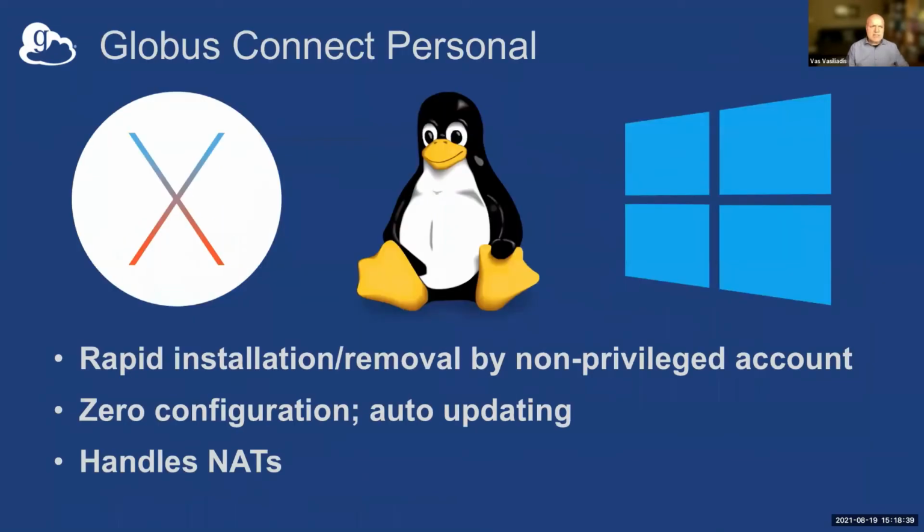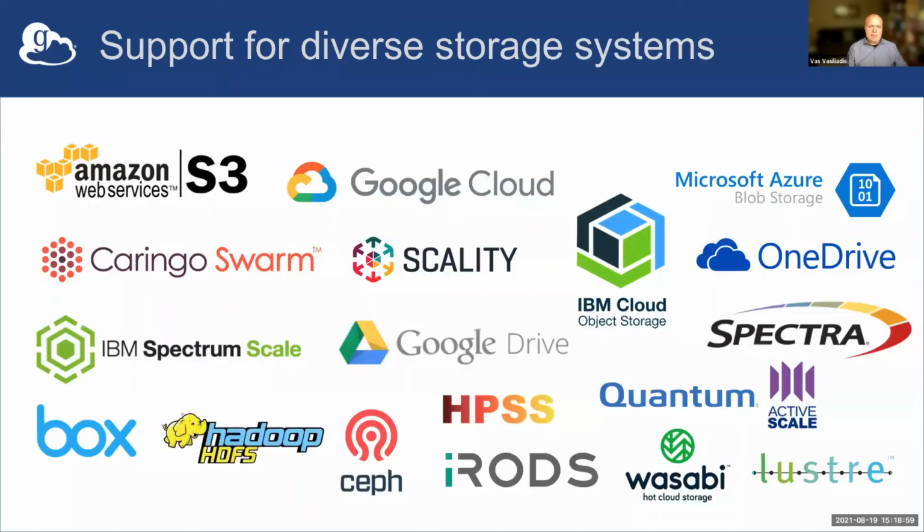For some systems, you would have to use Globus Connect Personal. For instance, a lot of the capture devices on the instruments are Windows-based. So we don't support Windows Server, so you would install Globus Connect Personal, and there are ways to structure that so that it can operate in the mode I was describing earlier. Alternatively, you may install Globus Connect Server, and we support a number of diverse storage systems beyond just regular standard POSIX compliant file systems.